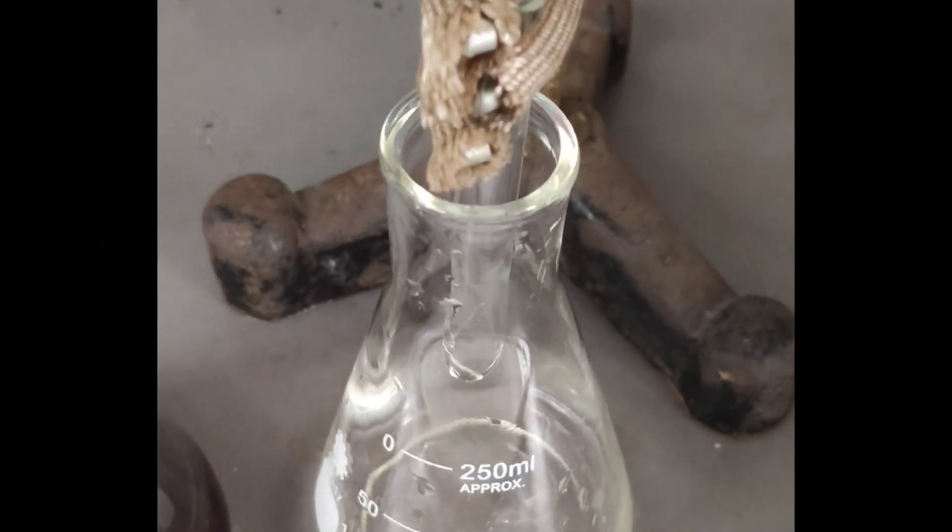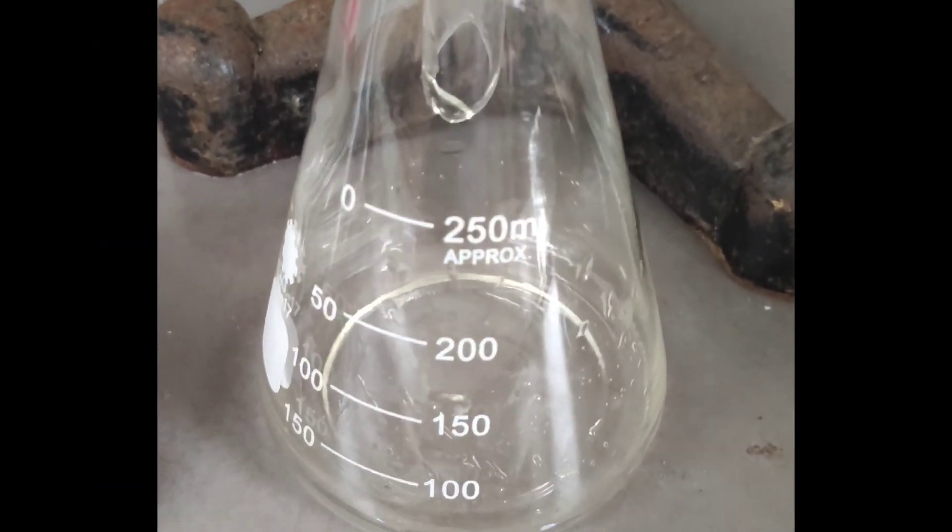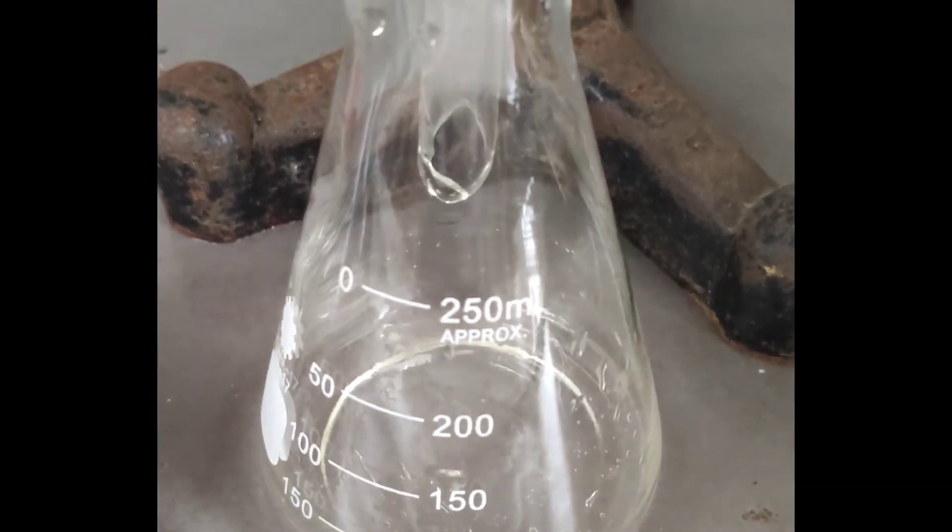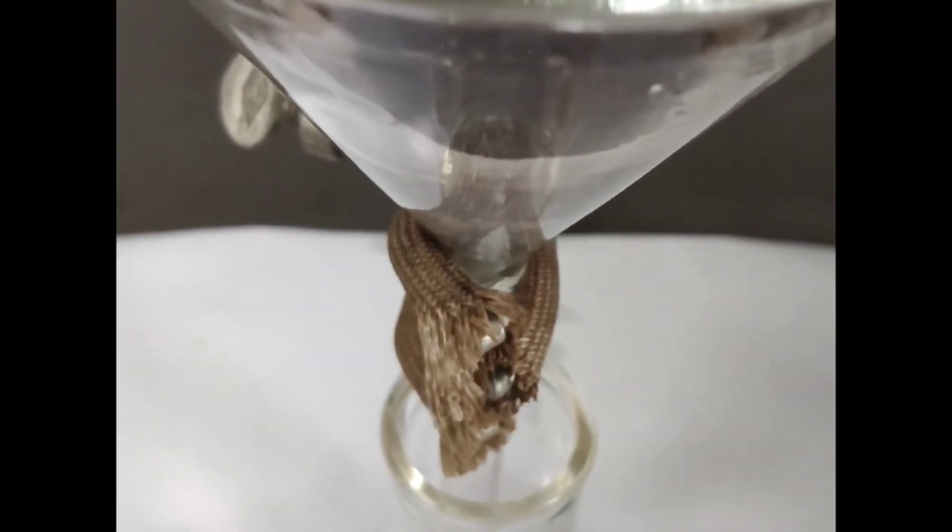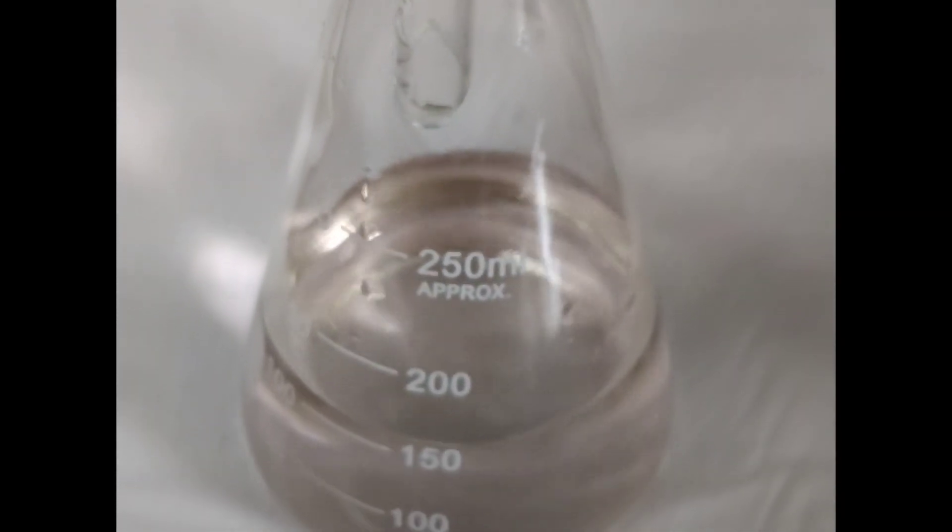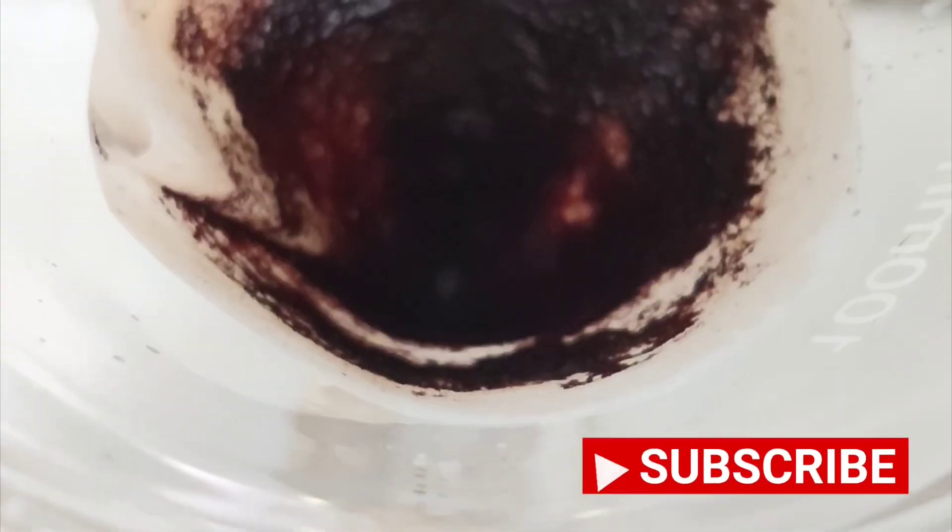We see that the filtrate is clear. No corrole has gone through. We wash the precipitate with water and we see that the filtrate has a slight pink color due to the excess cobalt which is dissolved in the water.